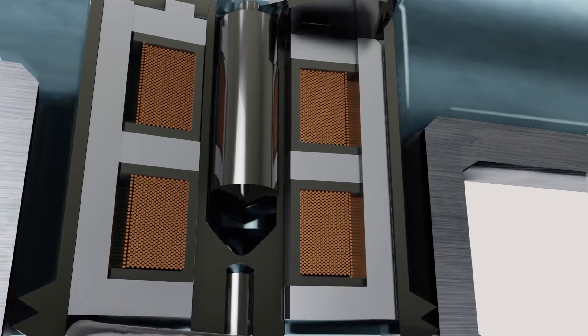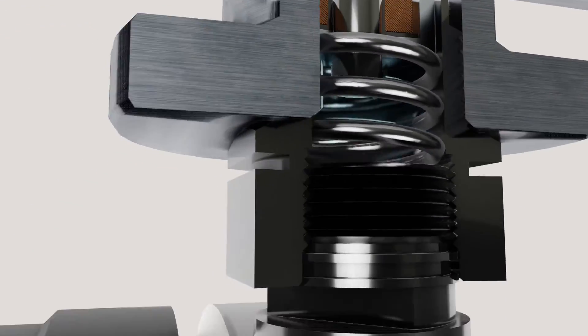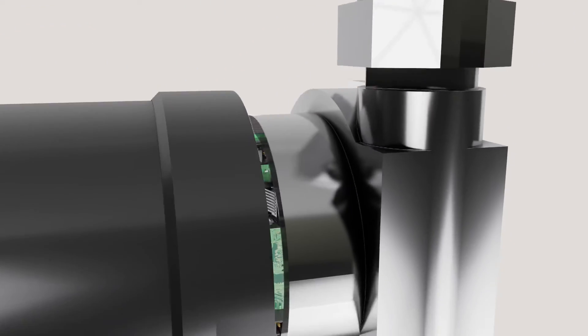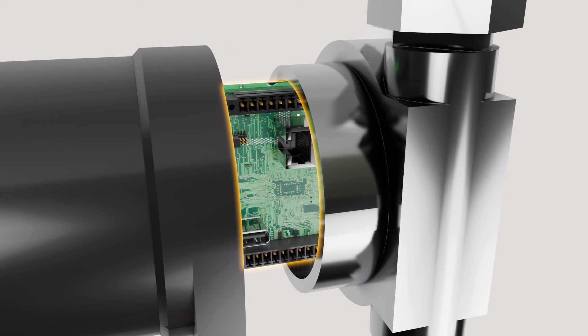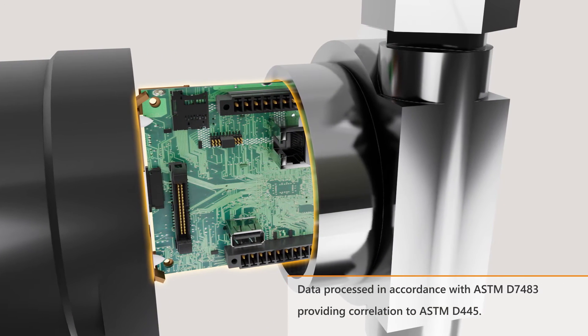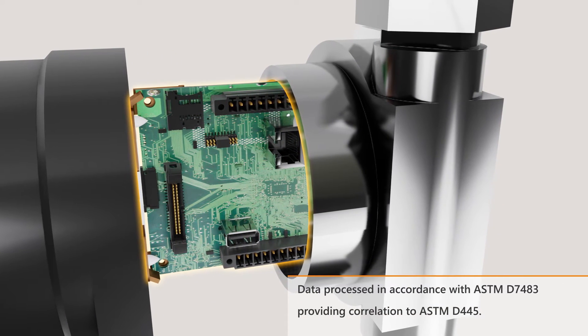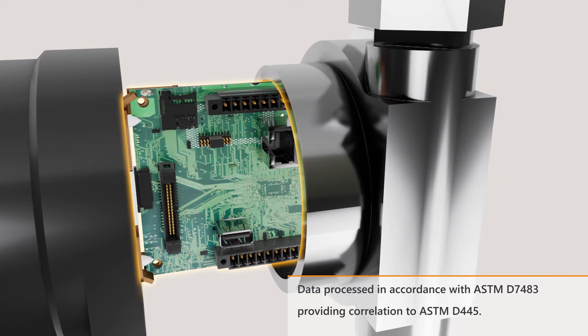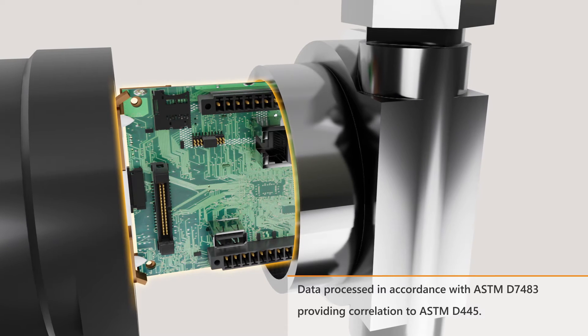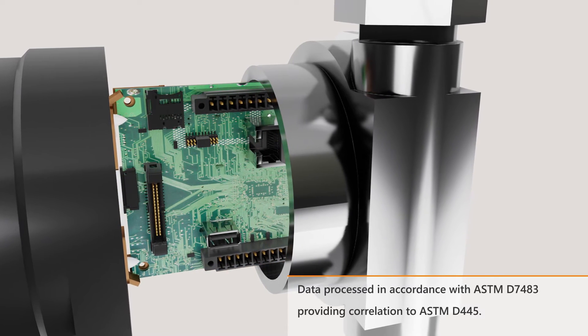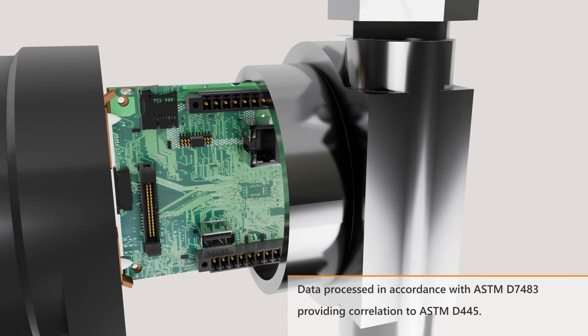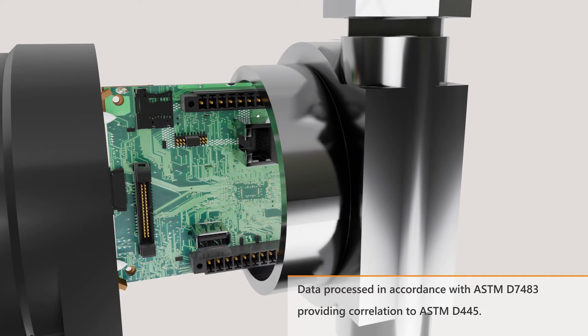Data from the sensor is processed in the electronics in accordance with ASTM D7483, providing correlation to ASTM D445.